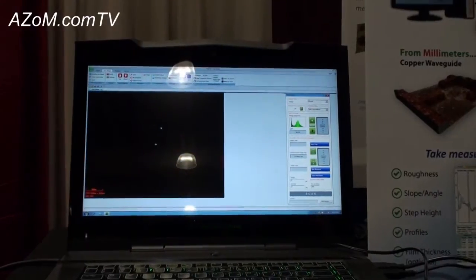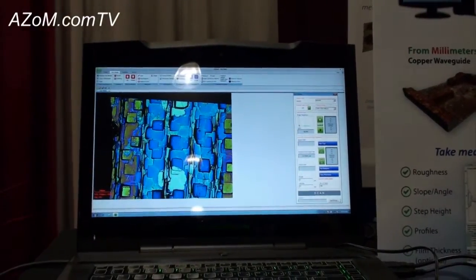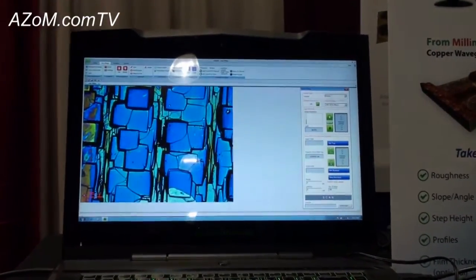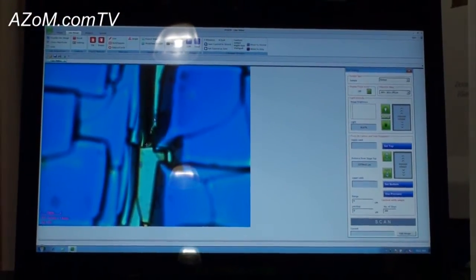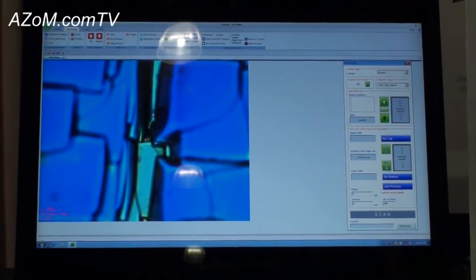This is using different magnification lenses. One can actually see the effect in the field of view, but more importantly the depth of focus. And that changes with the numerical aperture of the actual objective that's being used.